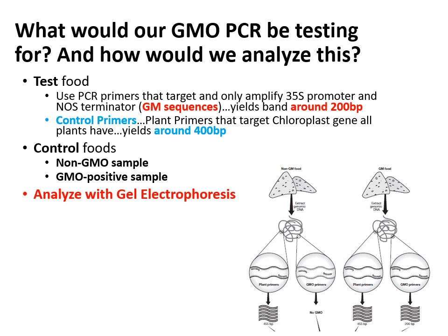So any food sample you would have tested in this experiment would have plant product in it. The control primers would recognize that and give a 400 base pair product. It's actually 455, but you don't have to worry about that. Just figure around 400 base pairs, and that would show you that your PCR actually worked.